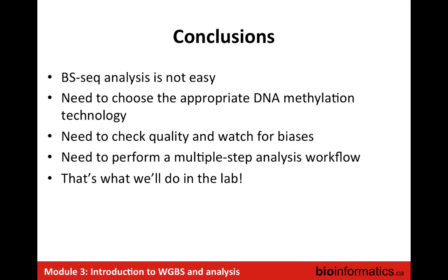Conclusions. Bisulfite sequencing analysis is not easy. I call this sort of an advanced bioinformatics.ca module. You need to choose the appropriate DNA methylation technology, so hopefully I gave you some strategies to pick what's appropriate based on your needs. You need to check for quality and watch for biases. We touched on that a little bit, but that's really quite critical.